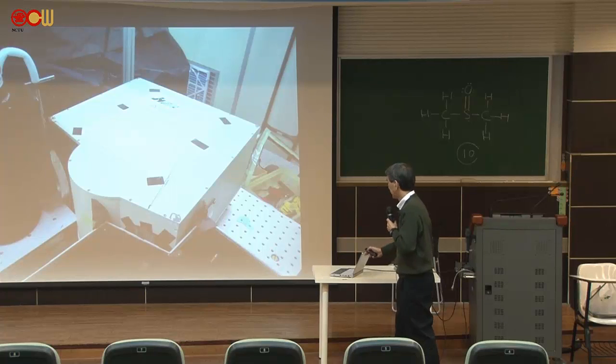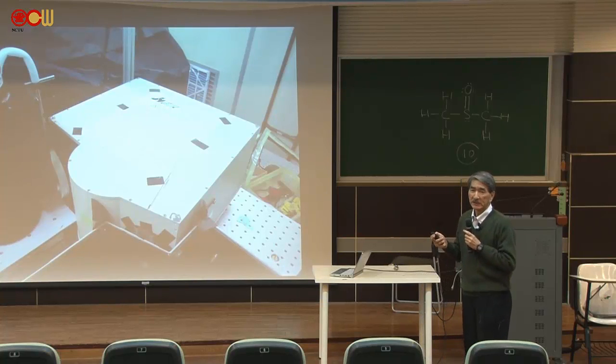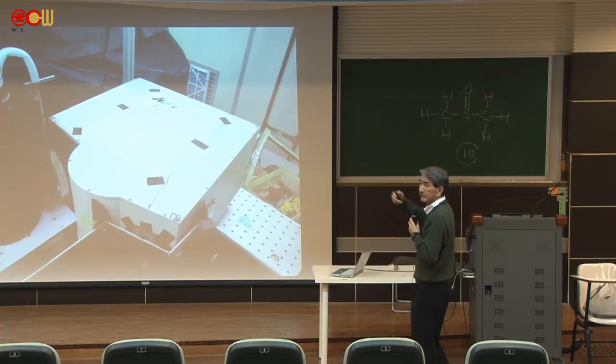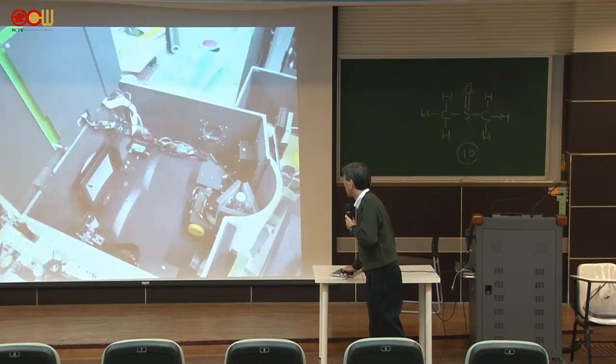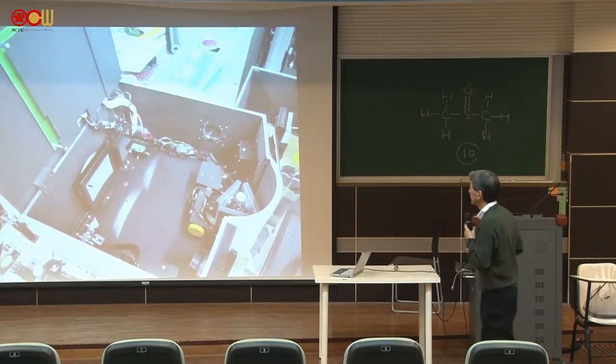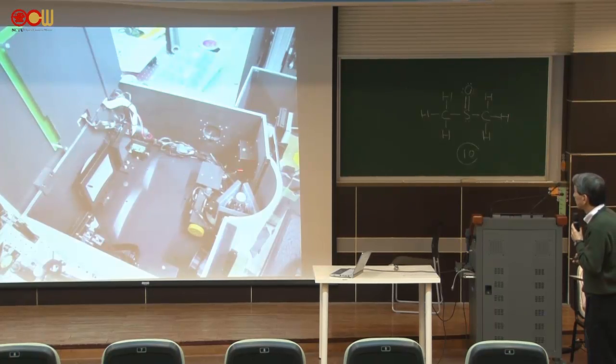Then the next one: we have another spectrometer connected to the previous one. The first one is used to filter out Rayleigh scattering, and the second one is used to disperse light to get the Raman spectrum. So again, inside, in this case, here we have a turret, and we have 3 gratings. And we can change the gratings by rotating this turret. And here you have the entrance slit, and this mirror coming here, and maybe going out this way.